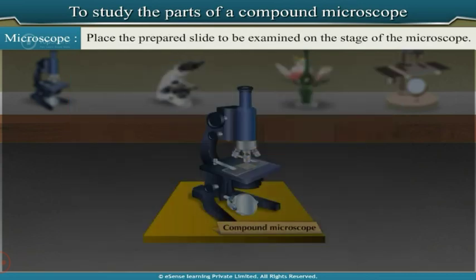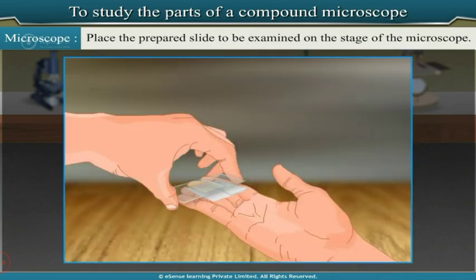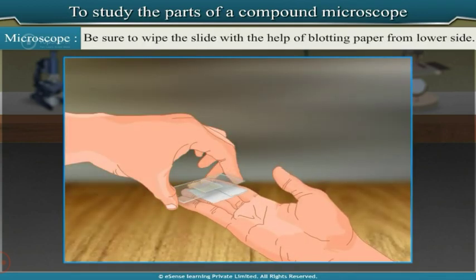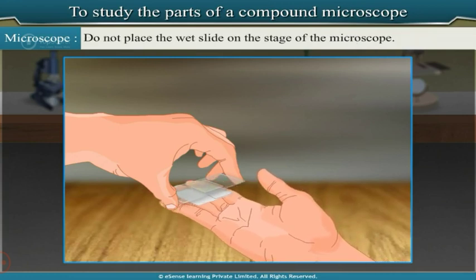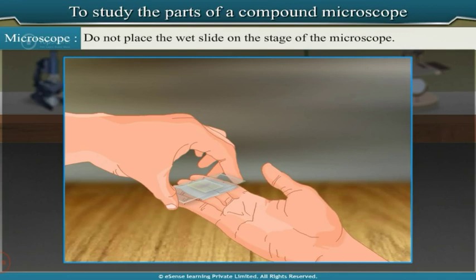Place the prepared slide on the stage of the microscope. Be sure to wipe the slide with blotting paper from the lower side. Do not place a wet slide on the stage.